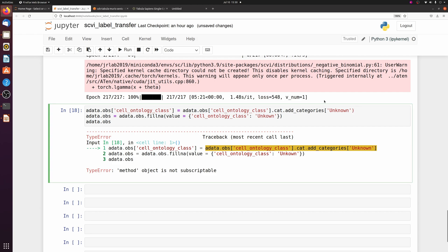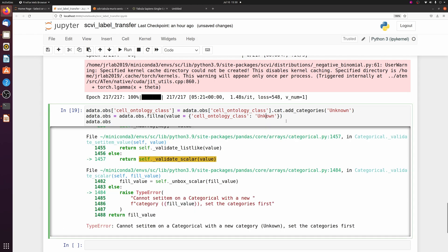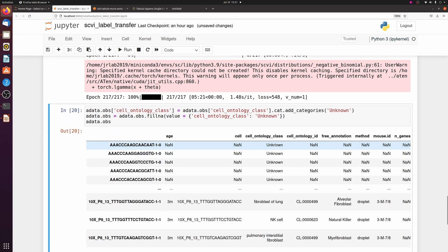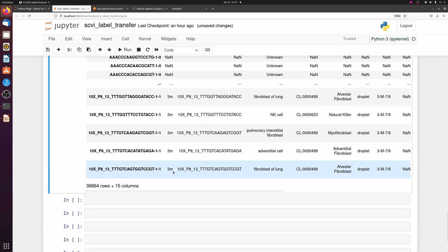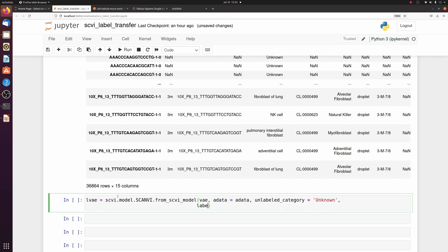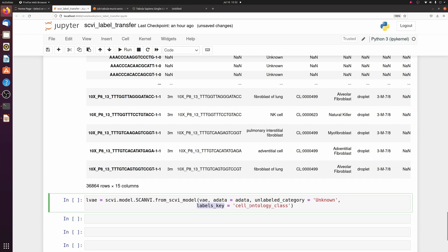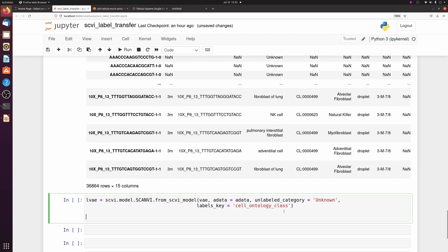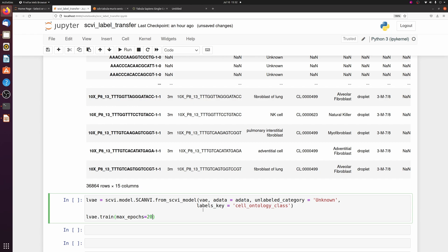This is supposed to be parentheses and I have to spell unknown correctly. So instead of NA, we have unknown, and now we can use this SCANVI model to predict the labels for each cell. We have to pass the unlabeled category, which is unknown, and of course the labels that we want to transfer is the cell ontology class. So we set this model up and then we have to train it.